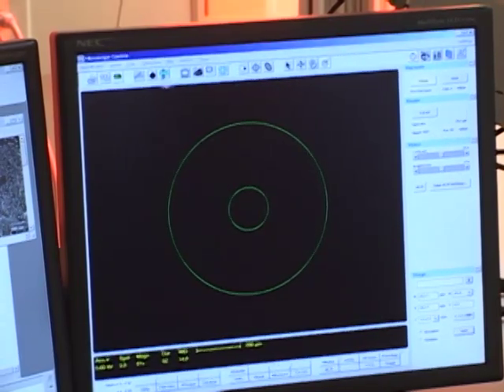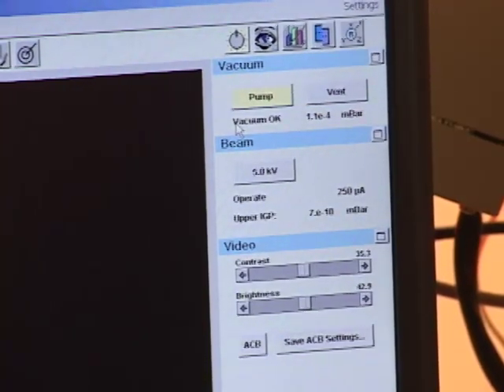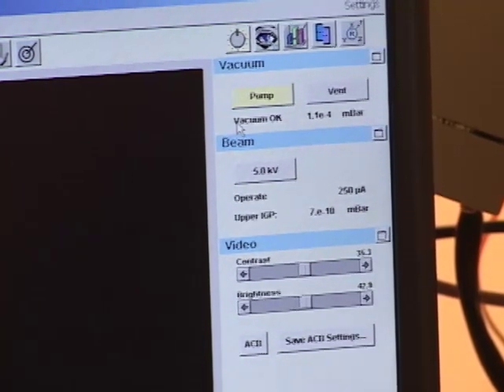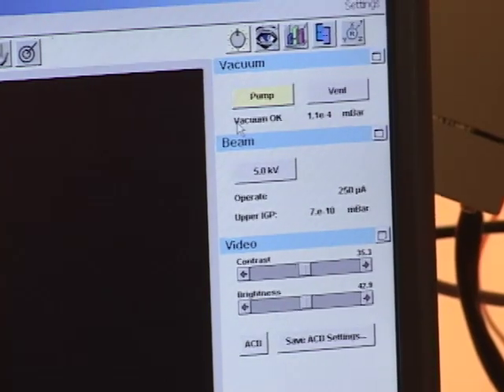Under the vacuum submenu, you see this status message now reads vacuum okay. And the pressure is 1.2 times 10 to the minus 4 millibar. The actual reading of pressure in the chamber is not as important as the status message that says vacuum okay. As long as it says vacuum okay, you know the pressure is low enough that you can open the column valve.